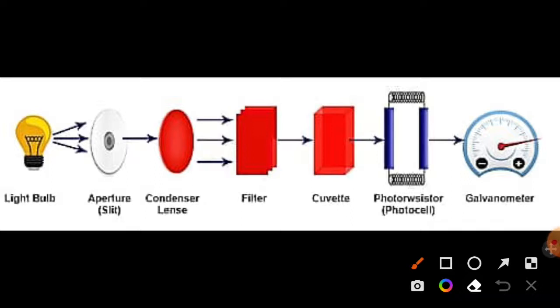Suppose I give you DNA in one Eppendorf tube and a protein sample in another. By looking with the naked eye you cannot distinguish which is DNA and which is protein. Now when I add ninhydrin reagent to the tube where I have kept the protein, you can visualize that yes, it is a protein, right? So that is why we are using coloration.